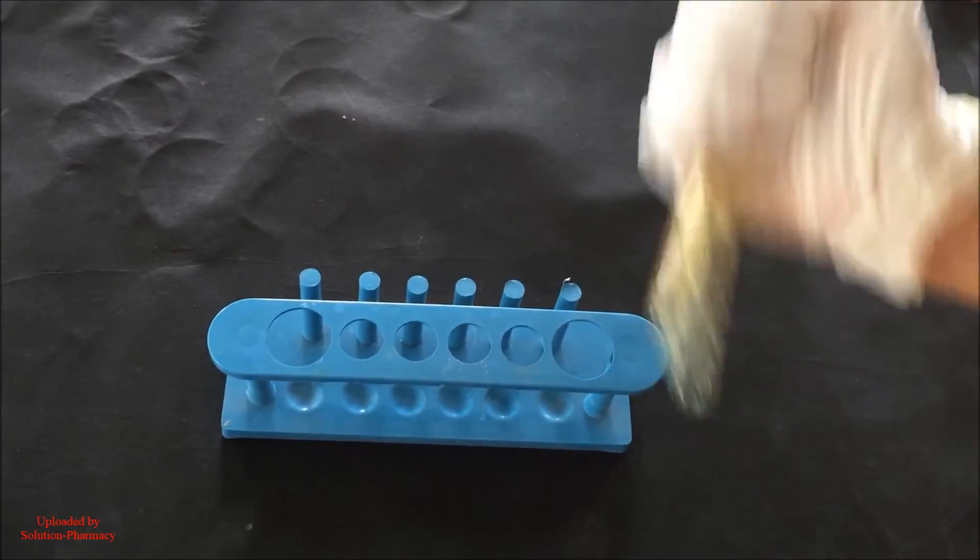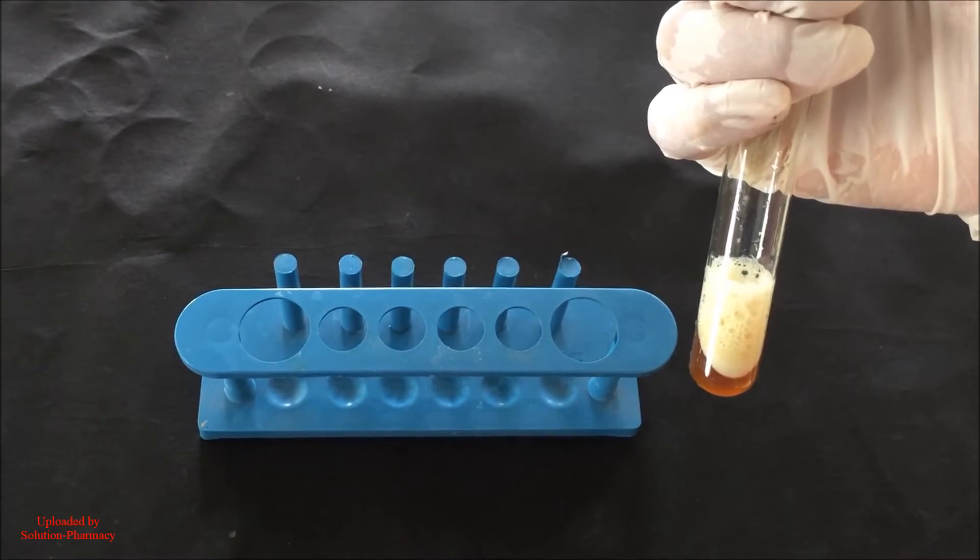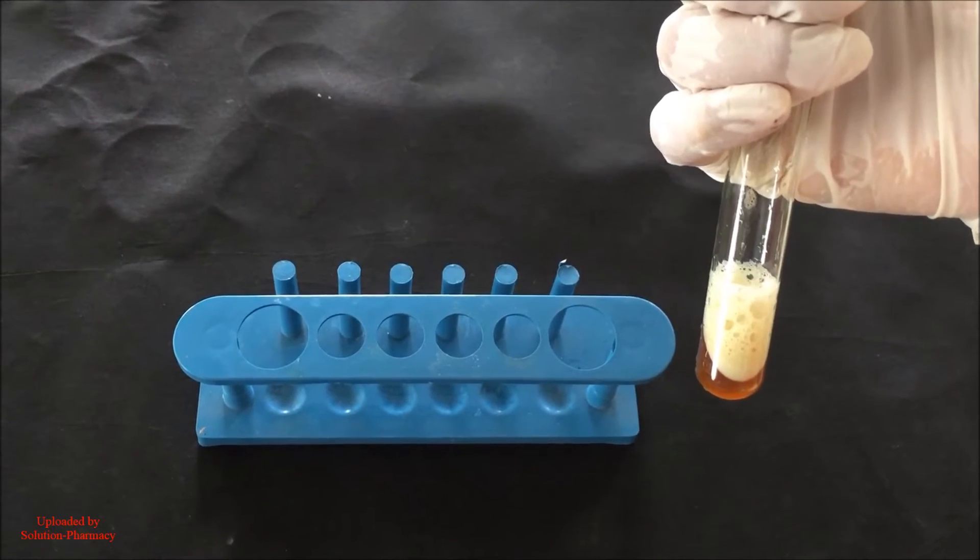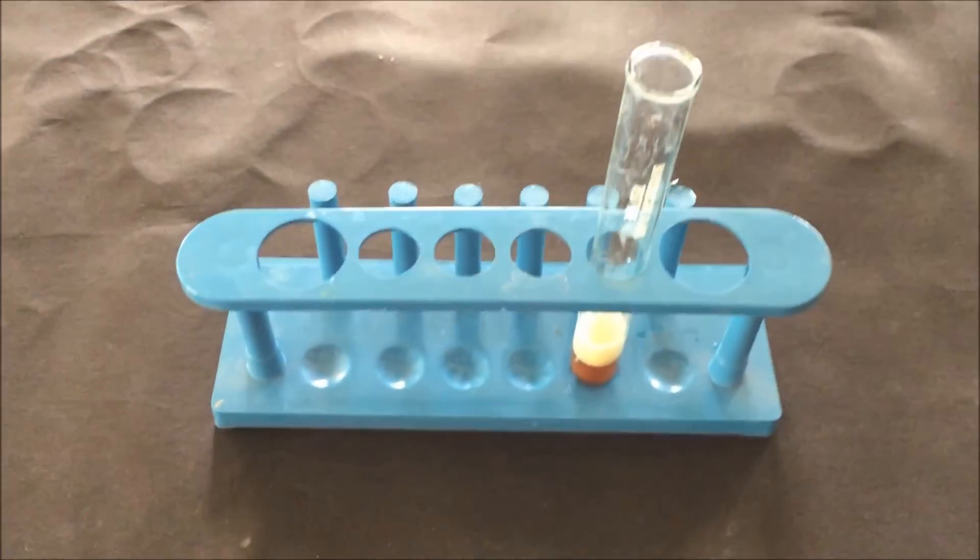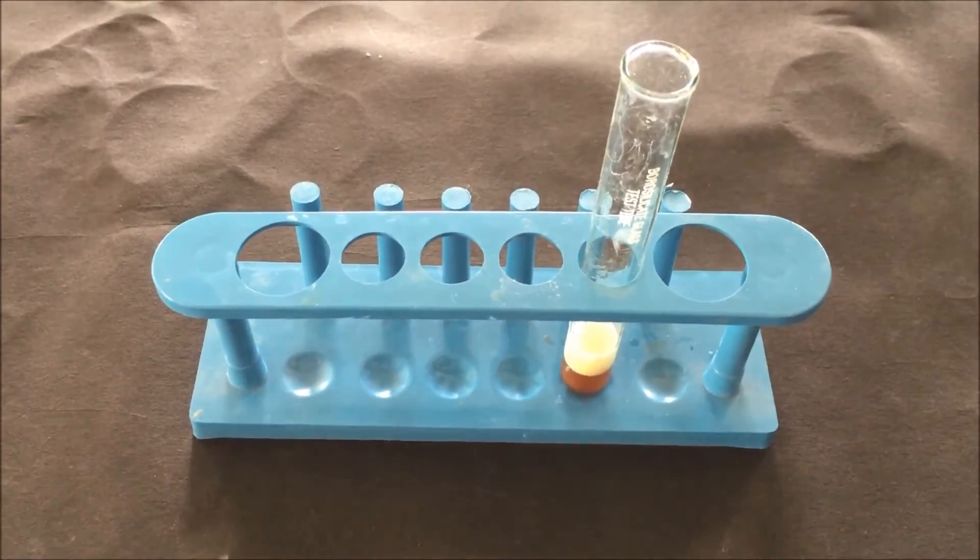Formation of foam indicates the presence of saponin in our extract. Then keep the test tube for 5 minutes in a test tube stand. If the foam is stable after 5 minutes, then it confirms the presence of saponin in our sample.